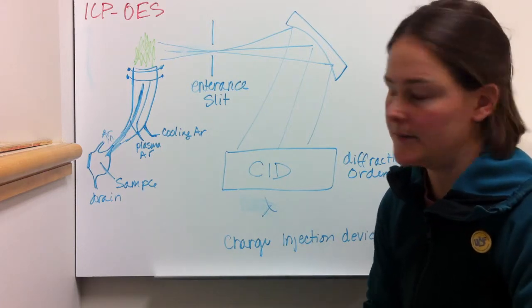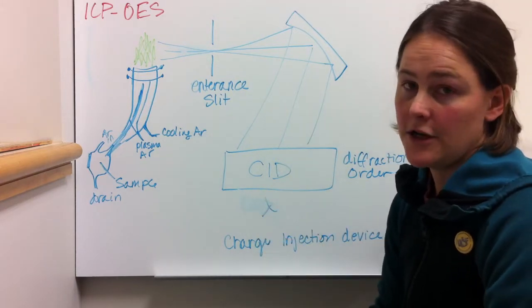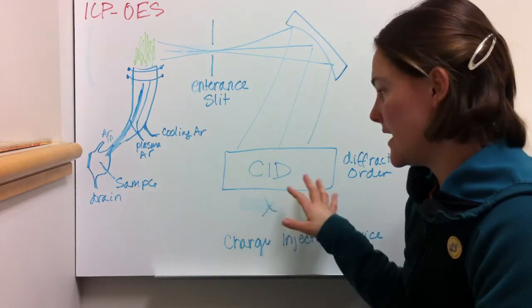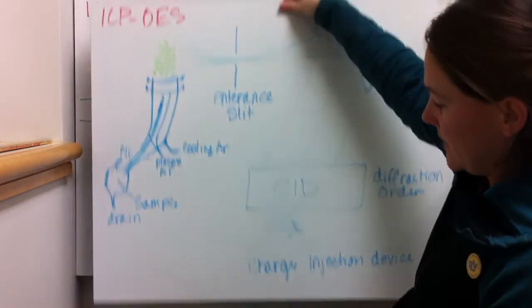We haven't talked too much about Bragg diffraction, but basically there are different diffraction orders depending on how it gets bounced off. And then you also have an intensity component for each. It looks like a bunch of different spots. You can look up what the display actually looks like, but it's a bunch of different spots, and you have an intensity for those spots. So that's how it works.